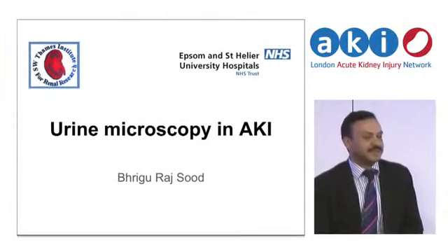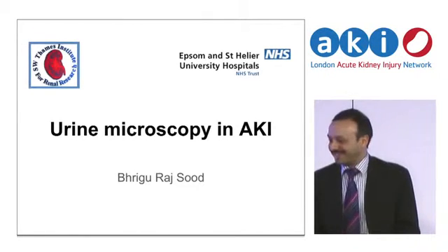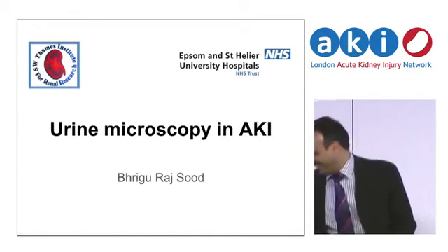It's described in your manual as everything a nephrologist needs to know about bedside diagnosis and urine microscopy. I made it a little bit less onerous for myself, expectation has been lowered. It's urine microscopy and AKI.